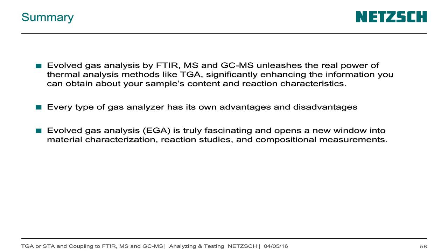So I'm finished now. Okay, well, thank you for that presentation, and we do have a few questions from the attendees. So the first of those is, what is the typical sample size needed for FTIR versus MS versus GCMS requirements?